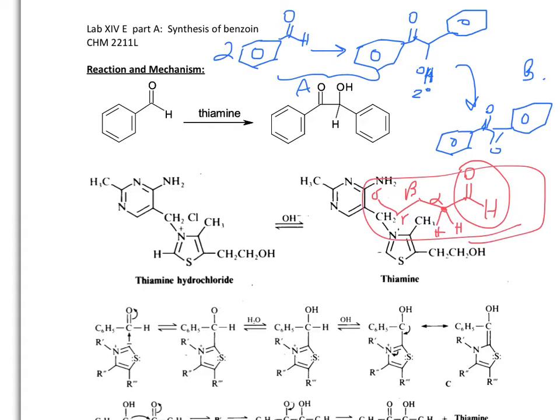And notice what you have in your experiment is benzaldehyde. So obviously there are no hydrogens at this particular carbon, because carbon is supposed to make only 4 bonds, and since it's a benzene ring, 3 of those bonds are a part of the ring and 1 is coming out to the ipso functionality, and so you would say that this sets up the stage to go through a benzoin condensation reaction. Realize 2 moles of the aldehyde are going to be dimerized, so in terms of yield you'll have to keep that stoichiometry in mind.